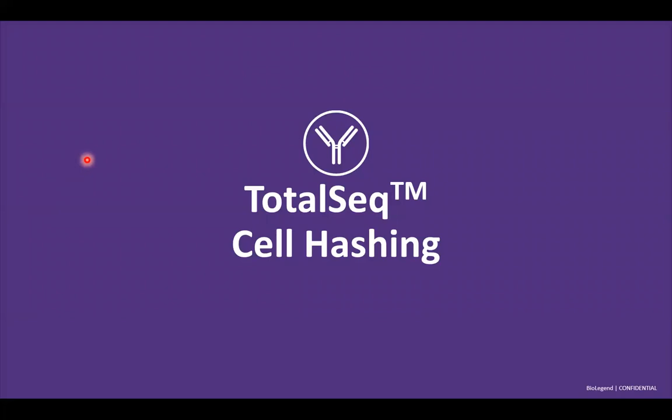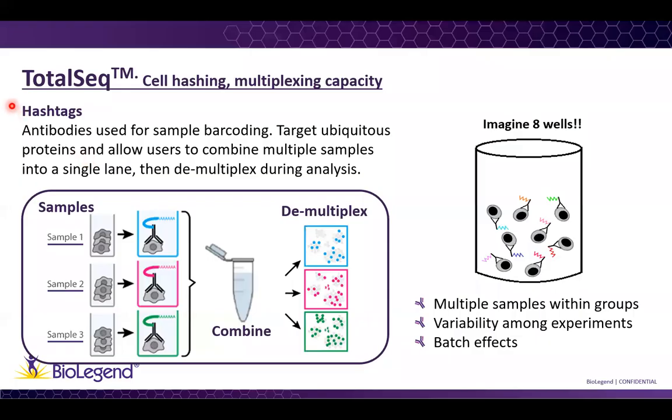Now let's talk about something that I am sure you will like. These are our hashtag antibodies. So what is cell hashing? It is a way to barcode different samples in order to be able to combine them into a single lane, and then demultiplex during the analysis.